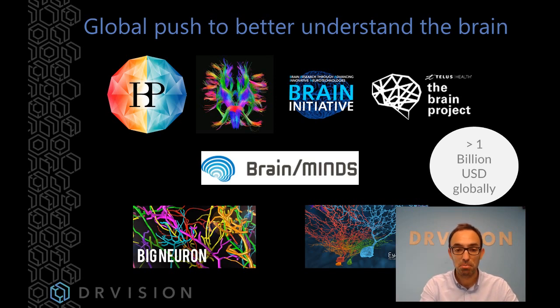And those projects, both of them, are very interesting because they create ground truth, which later on in those projects themselves or other people like DRVision, we could use that ground truth together with the raw data with a different type of technology, not the one I'm talking about today, but we could be using deep learning to train models that could automatically segment images of this type. But that's for another day, another discussion.